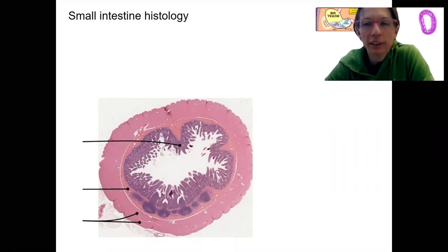Histology is a focus of lab, not lecture, so I won't ask you to identify these layers in lecture. But as you know, I think structure is important for function, and I'm right about that, so we want to go over this histology.